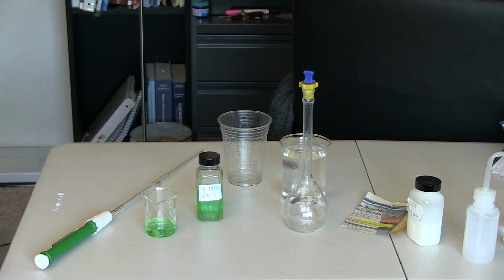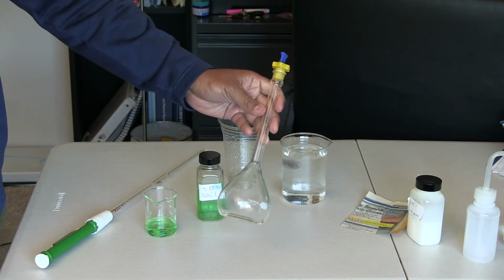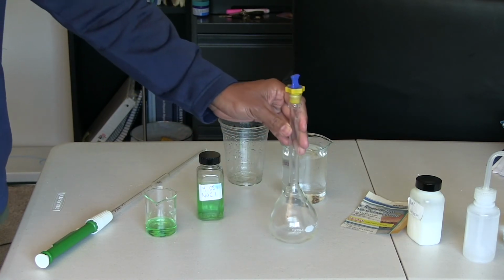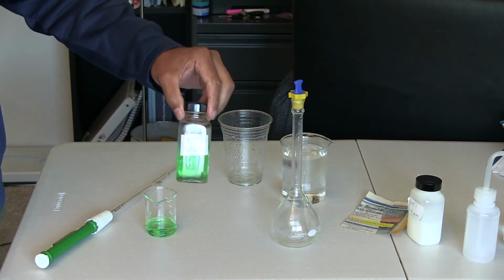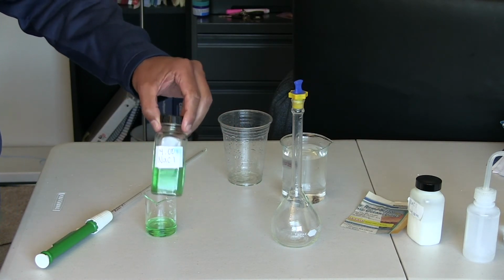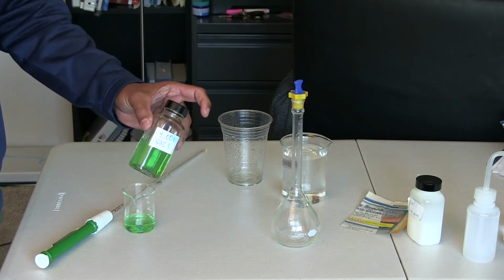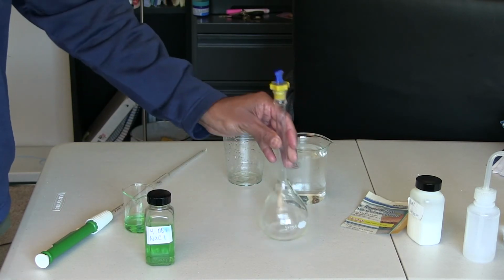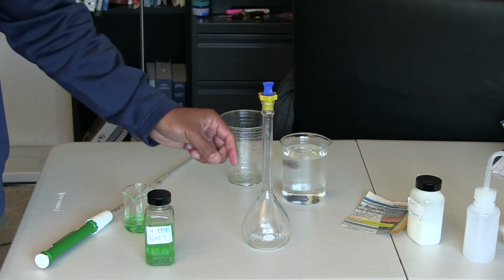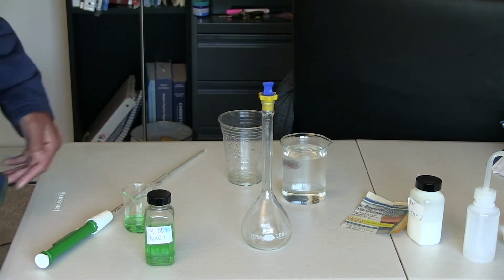Okay, so this is part 2 for experiment number 11. This is a 250 milliliter volumetric flask. It's quite large. So here we have our stock solution. It's a 4 molar aqueous NaCl solution, sodium chloride solution. What you guys need to do is calculate how much of this we need to remove and place into our 250 milliliter volumetric flask. Once we do that, we're going to dilute it with water to form our desired solution.